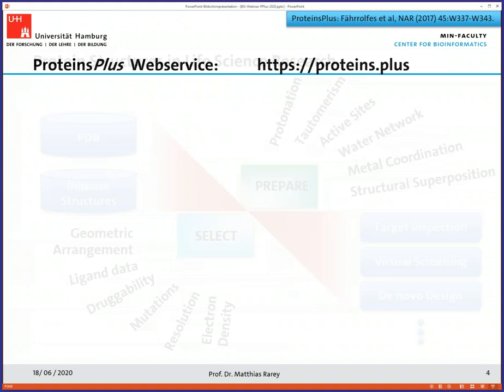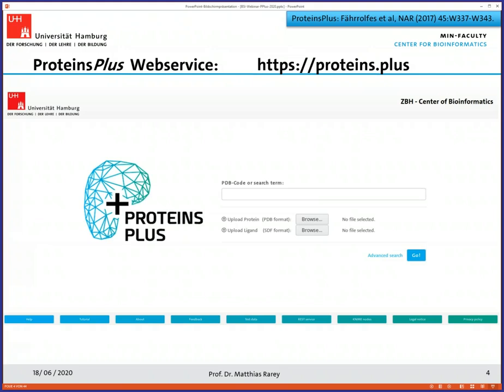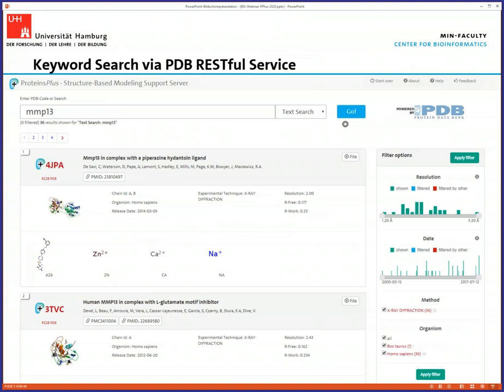This is actually how the server looks like. We wanted to keep it simple. You can type in the search term here and basically search in the PDB. You can also upload your files in case you want to work with proteins which are not available in the PDB. We are using a lot of technology from the PDB — for example, the RESTful service from the PDB for keyword search, which is a great service. We haven't done this by ourselves; we don't have to.